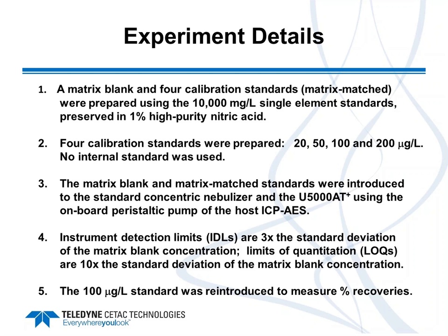Instrument detection limits, or IDLs, were defined as 3 times the standard deviation of the matrix blank concentration. And that, again, is the very hard water matrix. Limits of quantitation, or LOQs, were 10 times the standard deviation of that matrix blank concentration. And we read back one of the middle standards, the 100 ppb standard, to measure percent recoveries.